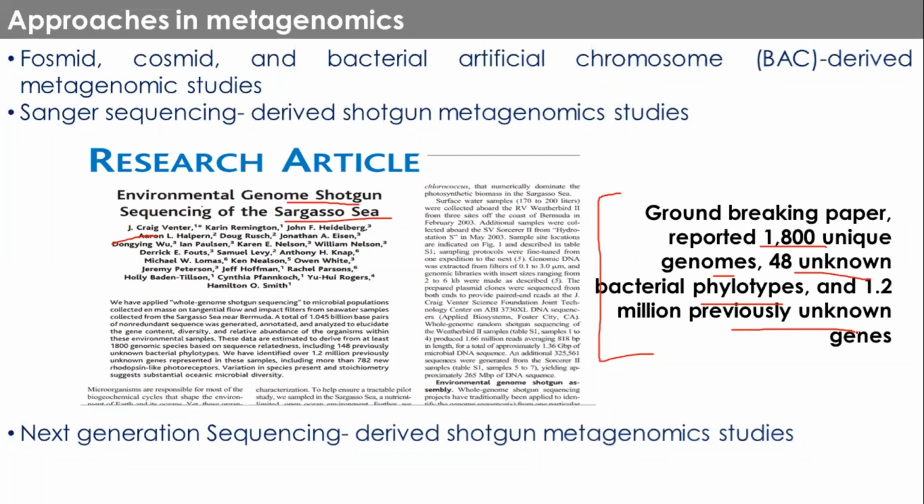Suppose I have collected the bacteria from Marina Beach, and I know the possible chemical composition of the water in that particular environment using different analytical techniques. I will try to create the artificial medium according to that, and then try to grow the bacteria.